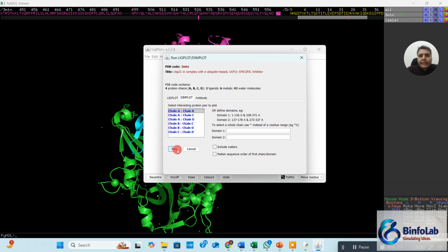Okay, but if you are interested, let's say, in chain A from residue 20 to residue 40, then chain A, and again residue 30 to residue 50, chain B. You can do this.